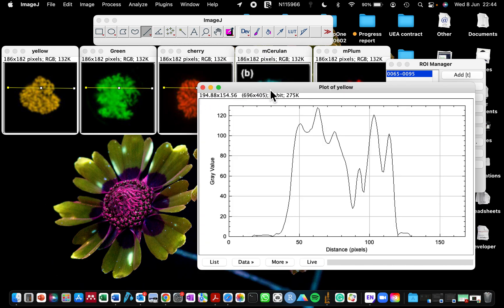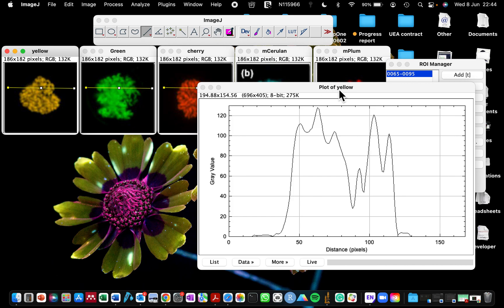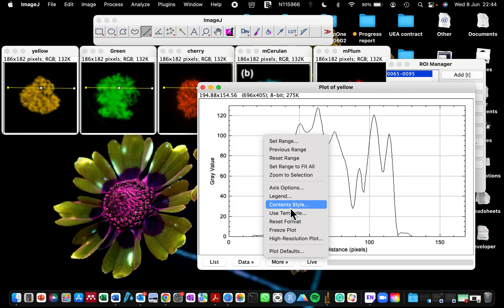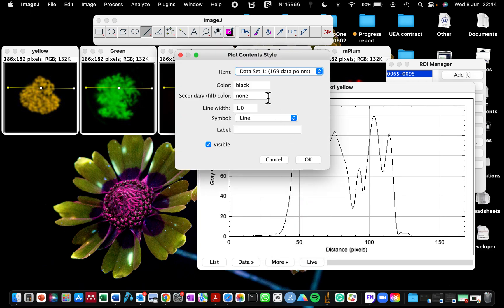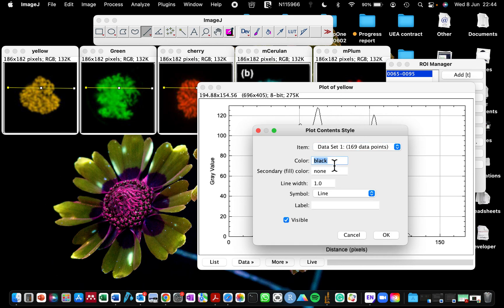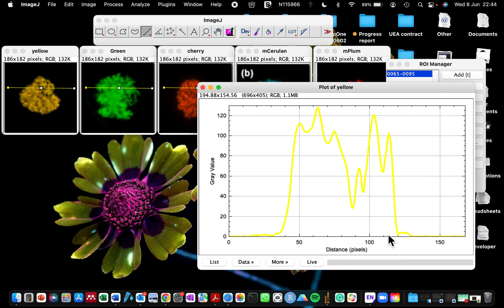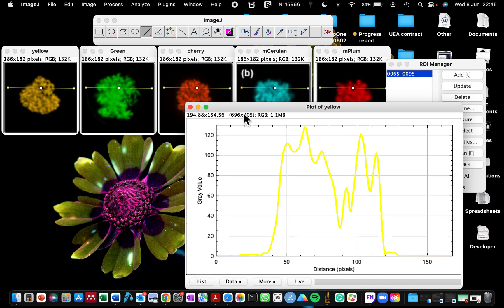Next, go to Analyze > Plot Profile. When I click on Profile Plot, it creates a single plot for the yellow channel. I immediately modify this plot by going to Content Style, changing the color from black to yellow, and increasing the line width to four to make it more visible. You can see the line is no longer black but yellow.